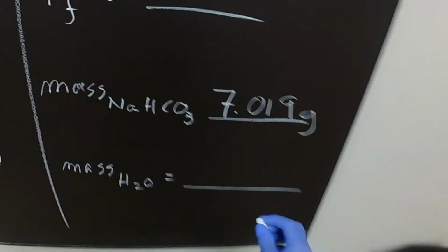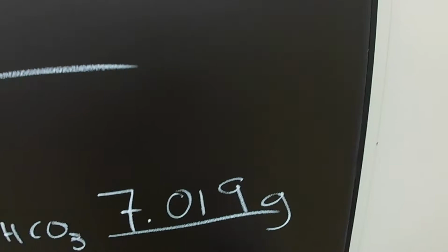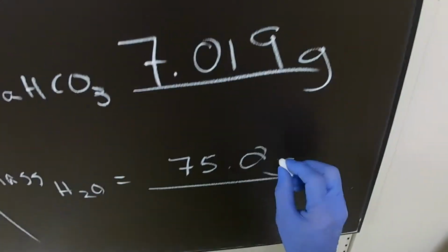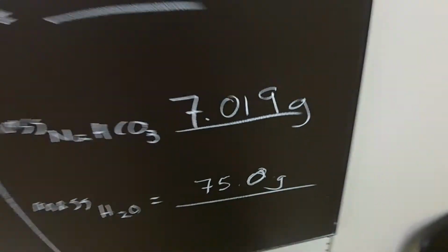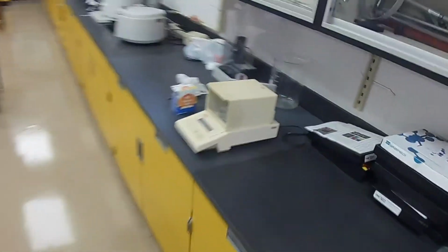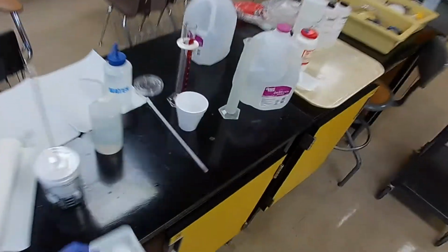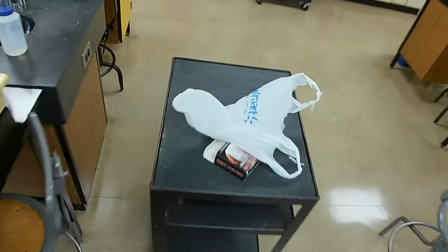And the mass of the water, exactly the same as in the previous experiment. Now all we need is temperatures, and we'll have all the data we need to determine the various heats of the processes. Okay, let's see. Stick this back in its bag.